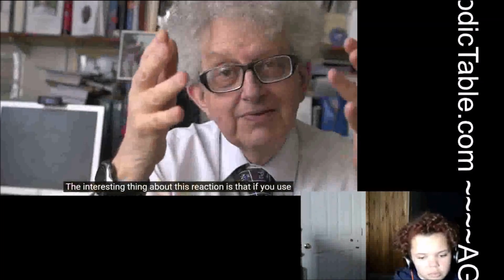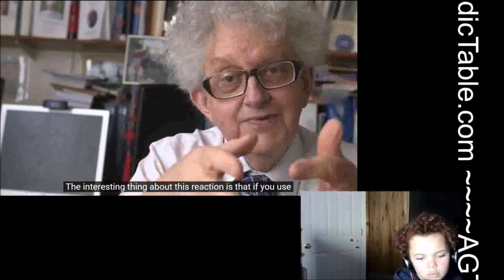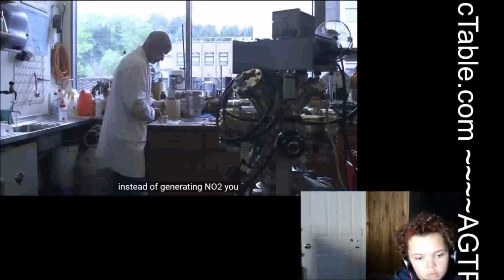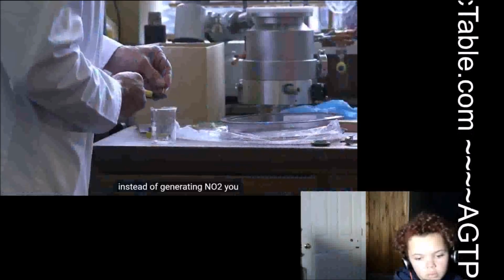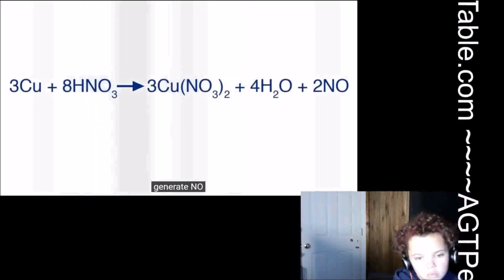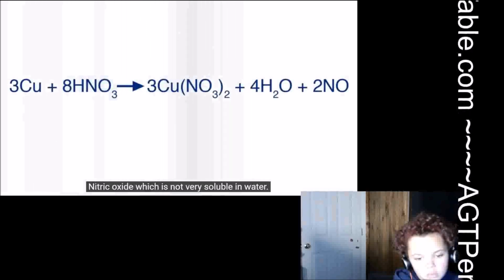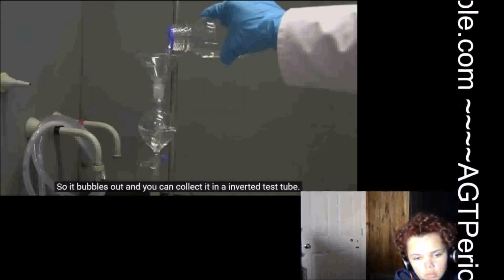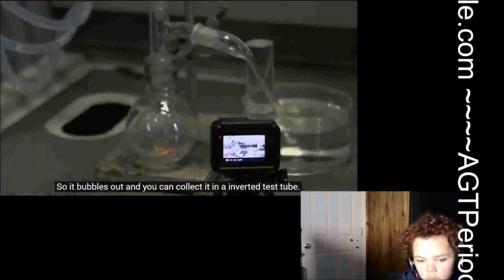The interesting thing about this reaction is that if you use dilute or more dilute nitric acid, instead of generating NO2, you generate NO, nitric oxide, which is not very soluble in water. So it bubbles out and you can collect it in an inverted test tube.